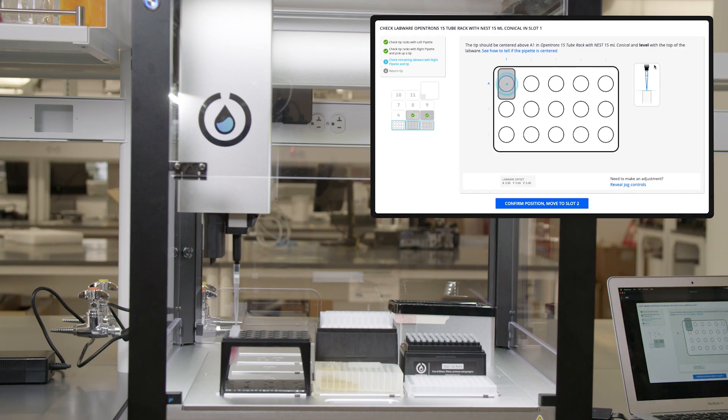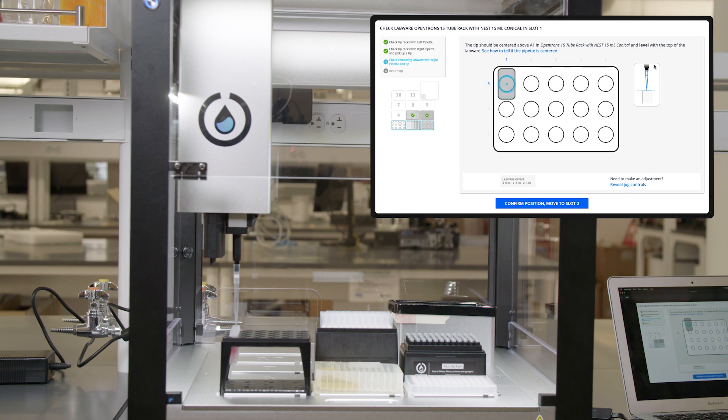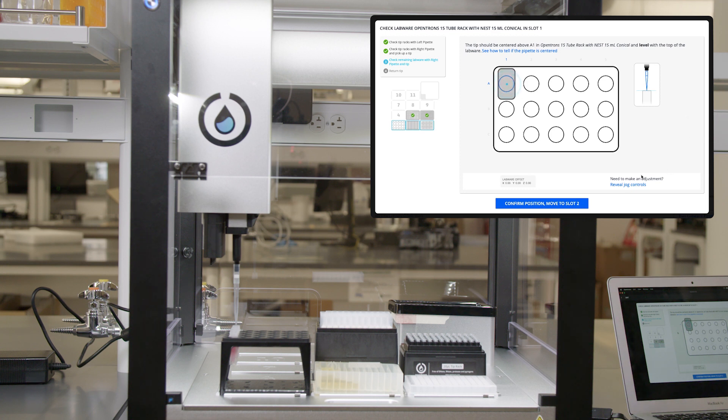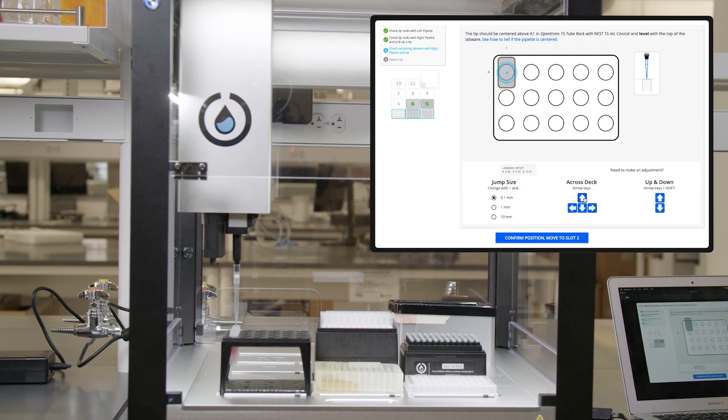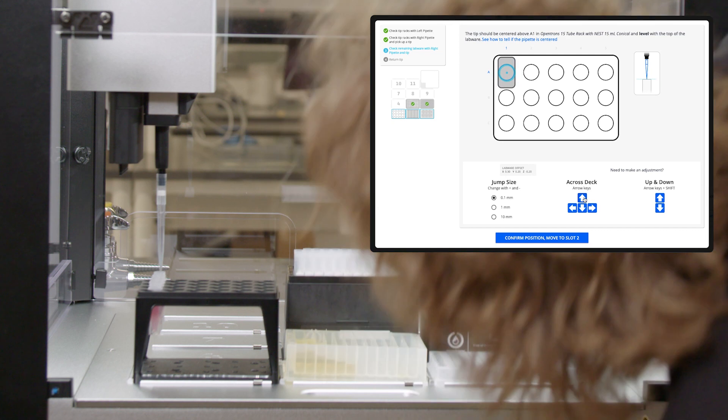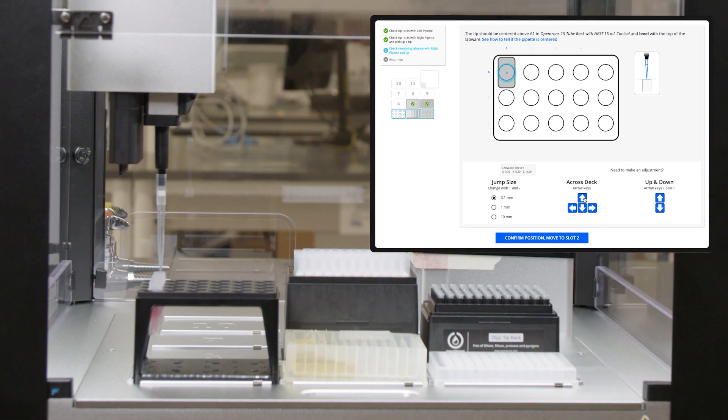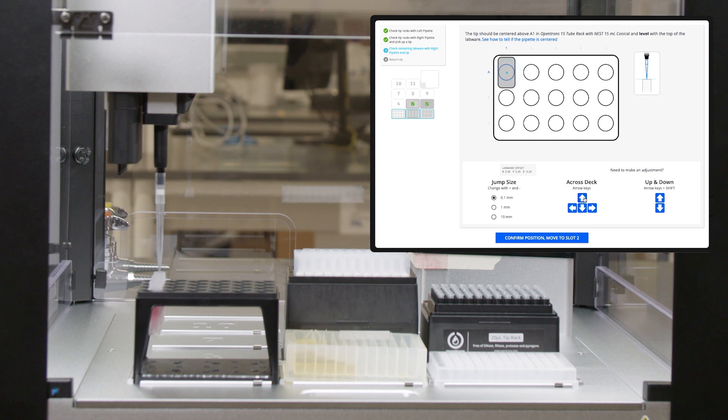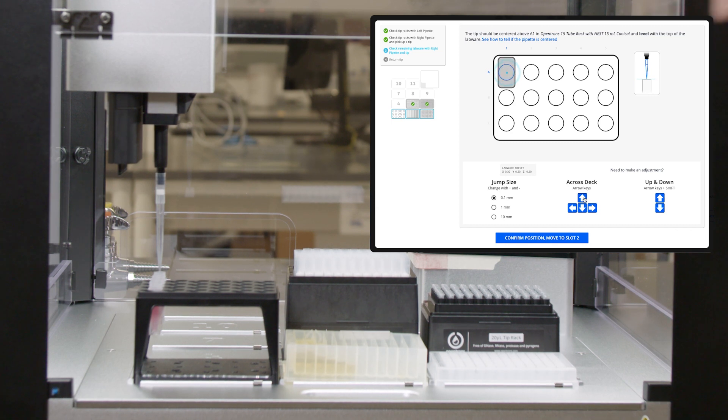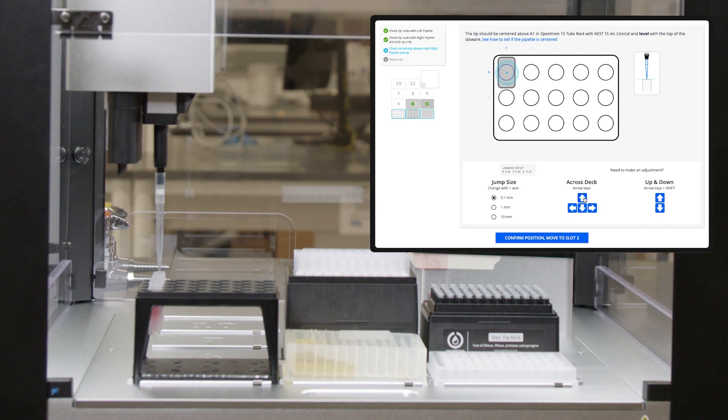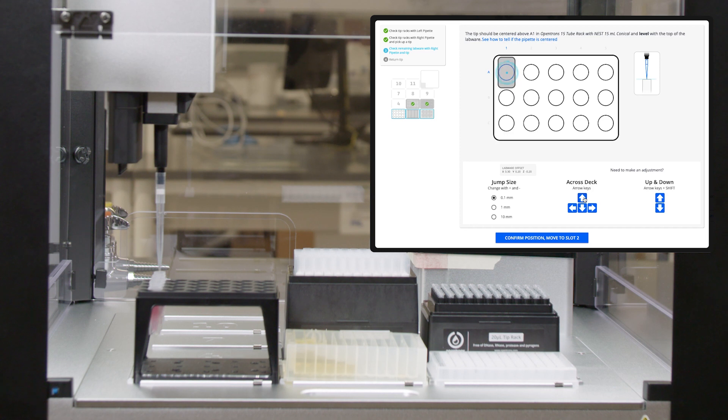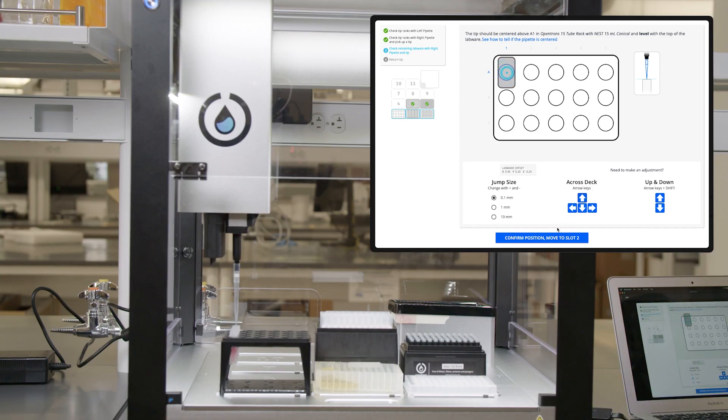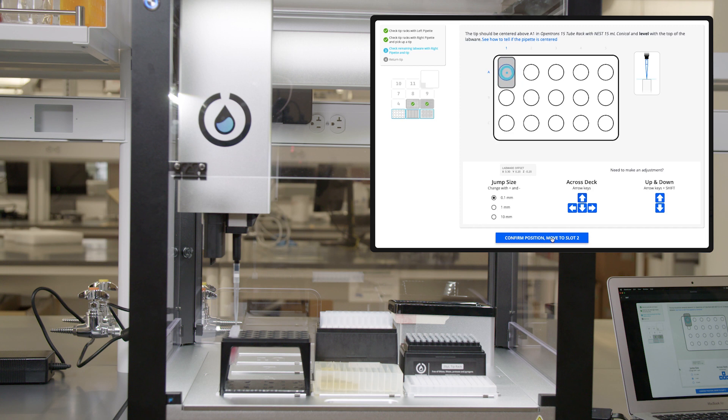The tip should be centered in well A1, and the bottom of the tip should be even with the top of the well. I'm going to jog it because it's a little off. So again, I need to reveal the jog controls. The tip is centered in well A1, and the bottom of the tip is even with the top of the well. So I will confirm position.